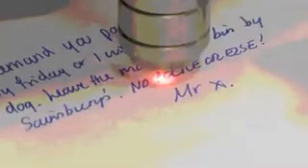This creates a problem, since they use pigments which do not dissolve in solvents, making it difficult to test them by TLC. Moreover, because it is not always possible to tell different inks apart using microscopy and the VSC, the ability to tell different gel inks apart becomes harder. So a new way to test and compare different gel inks must be found, and that's where I come in.